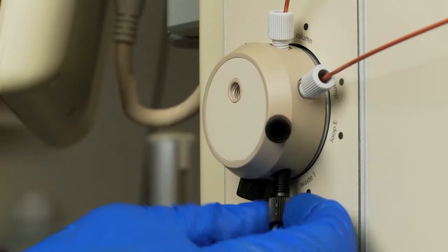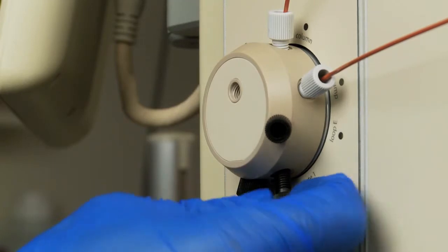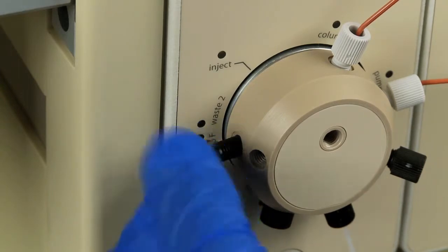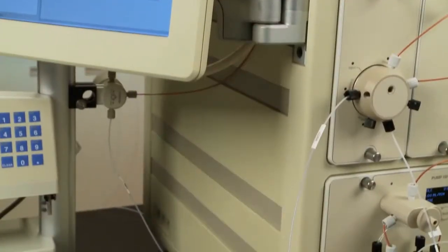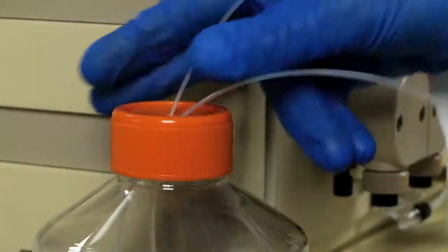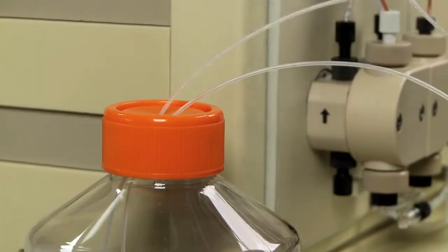Now you will make tubing connections to the inject valve. Connect the waste lines to waste ports 1 and 2 on the inject valve and place the ends into the waste container. The waste container should be placed next to or below the NGC. Do not place the waste container on top of the NGC.